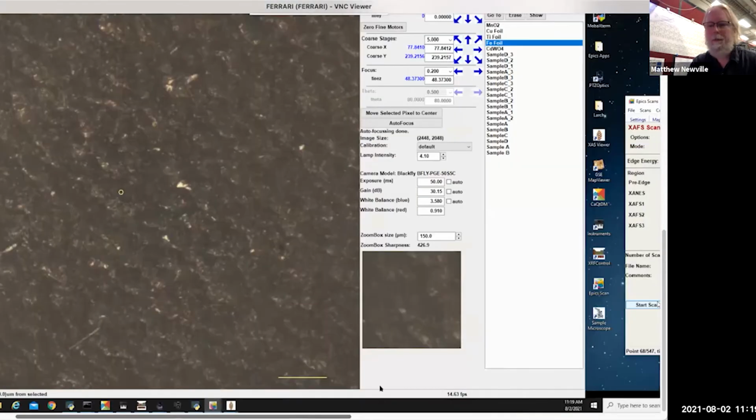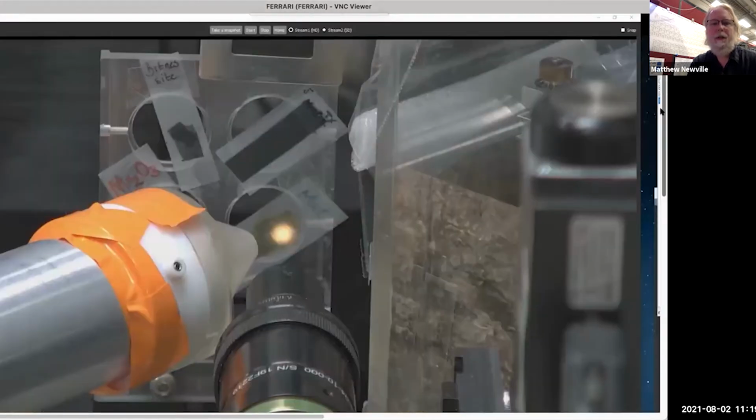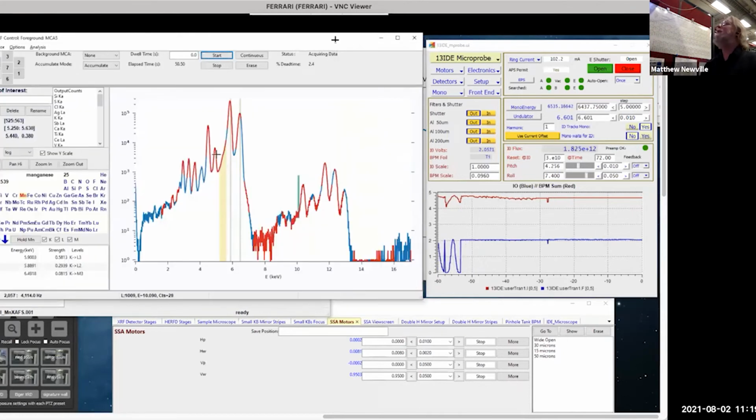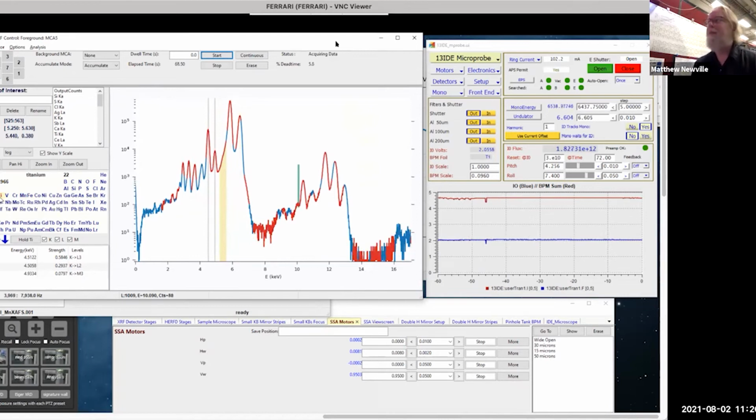Right, so we're here on this sample. If I show the sample stage with the sample in, and the fluorescent spectrum was behind this. We have a lot of screens. This is the fluorescent spectrum. Actually, there's an interesting effect you can almost see here. We're just below the edge. You can see the manganese, but it's sort of shifted and lower in energy. And then this sample also has actual titanium in it. I think that titanium is from the tape. The magic tape will often have titanium in it as the whitening agent.